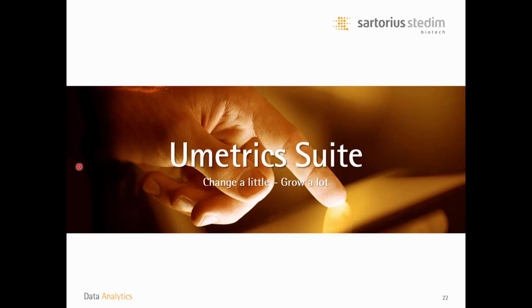So, with all this information and demo in mind, I would like to conclude by saying that what we would like to do from the Sartorius Stedim Data Analytics side is to help our users that are using the Umetrics Suite and analyzing their historical data to find the golden nuggets in the data.